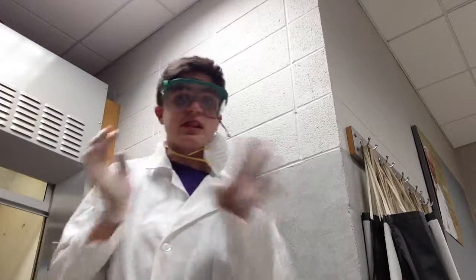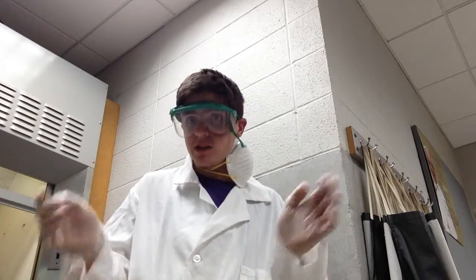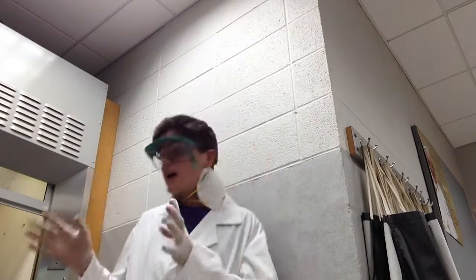One thing to notice is aluminum powder is pretty dangerous. Aluminum's quite reactive, and when it's a powder, it has lots of surface area. And so that extra surface area means it can react with the oxygen in the air or things in my body really readily. So the first thing I need to do is handle this in my fume hood. The fume hood's going to take most of those powders and keep them away from me. It's going to keep them away from any open flames, which would cause a big fireball. It would keep them nice and contained. Lets me control the reaction.